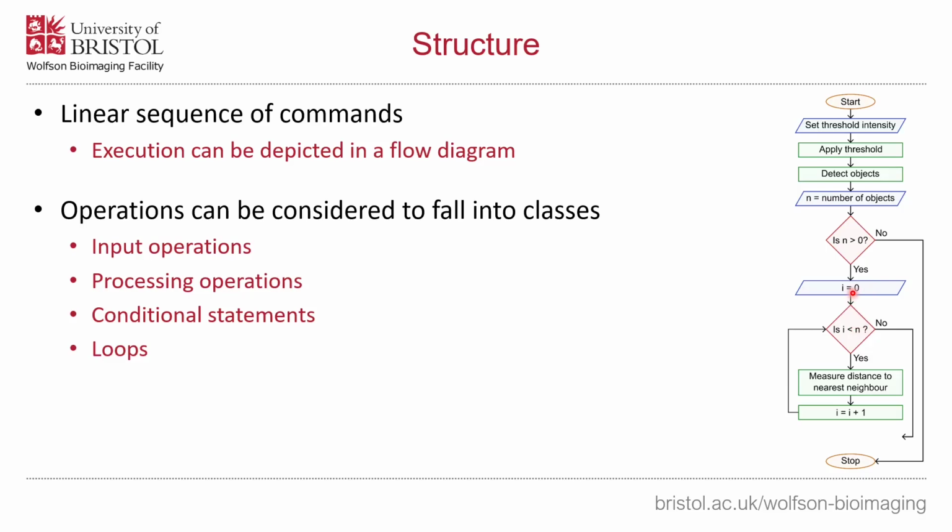We will go through this in more detail, but basically what we're doing is we're starting off by saying, is I, which is currently set to 0, less than n, and let's say n is 5, like we've detected 5 objects. So yes, I is less than n, so we continue. We would do some custom processing step here, again, with the square green box. We'll look at these custom functions later on as well. And then we do another processing step here, which just increments that value of I by 1.